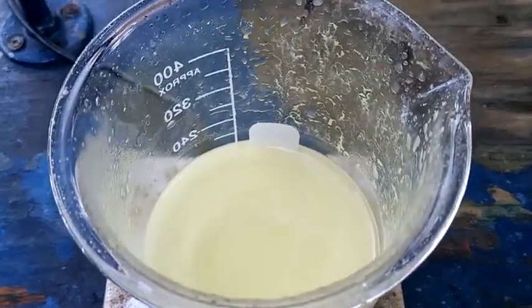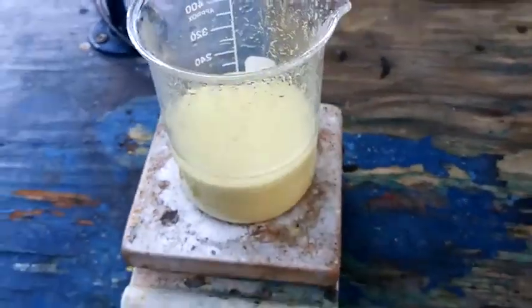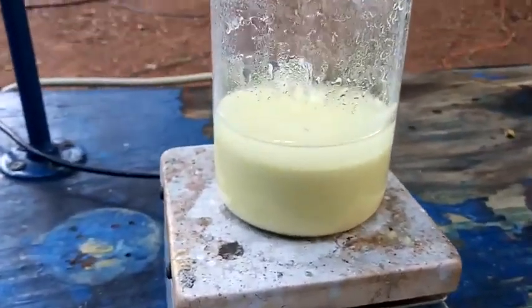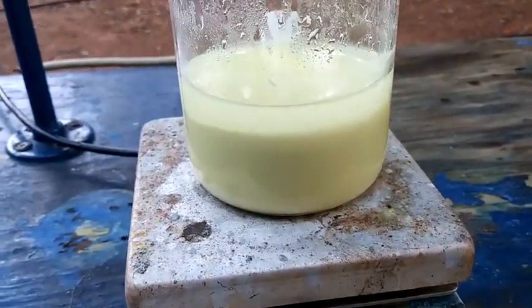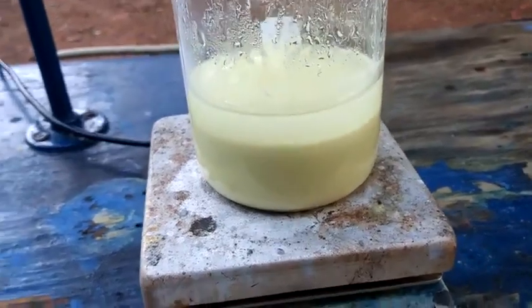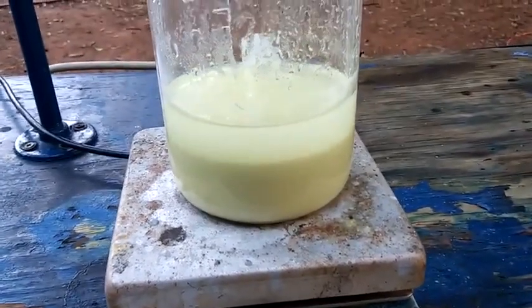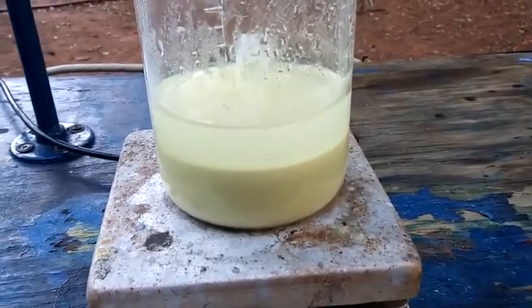But you guys can see what color it is. You can see that it's already starting to separate out. The moment I turn off the stirrer, it is so heavy. So filtering this stuff off should be pretty easy.